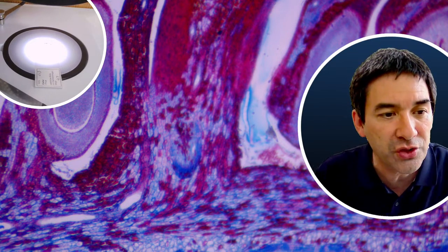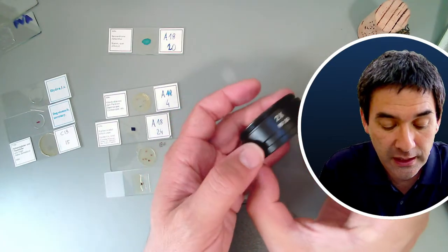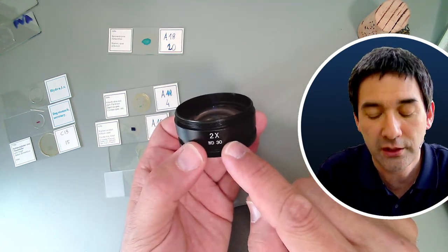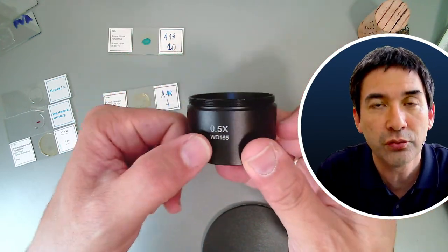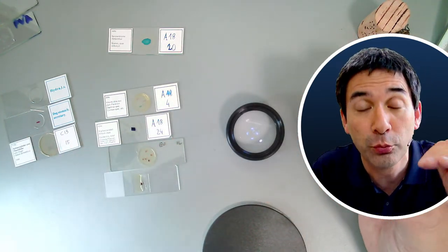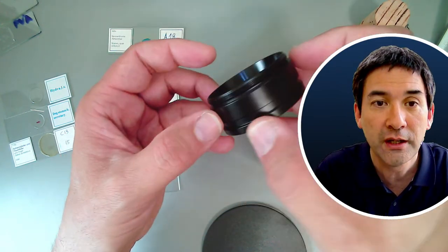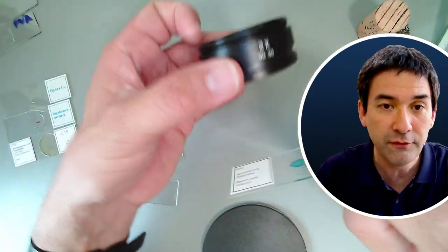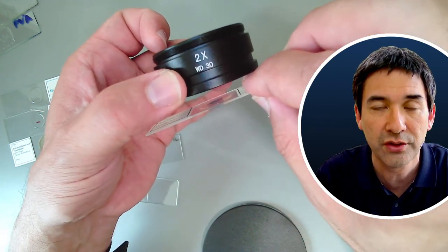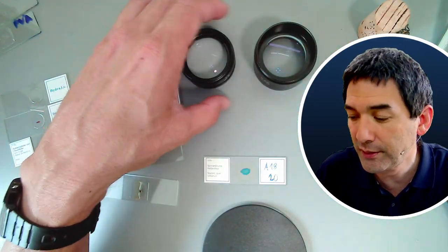What I'll do now is switch back to the desk view and show you some of the attachments. My microscope can have those Barlow lenses attached on the bottom — the 2x one doubles the magnification. The other one reduces the magnification, and the reason you might want that is to increase the working distance between the object and the objective, so you can put larger objects in. The 2x Barlow requires you to be very close and that makes lighting difficult, so I'm not going to use those.